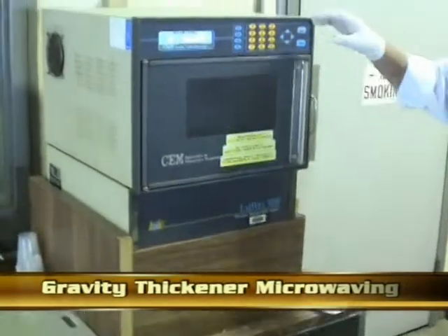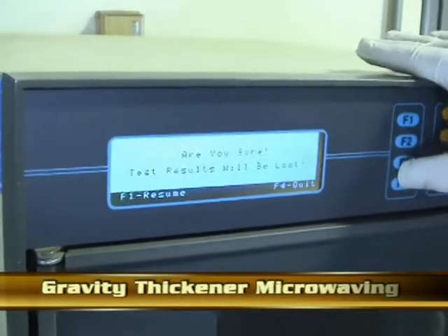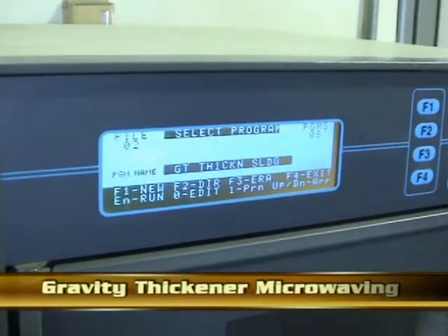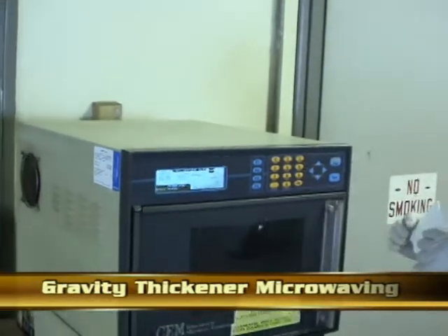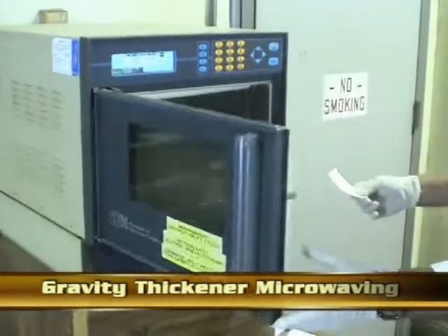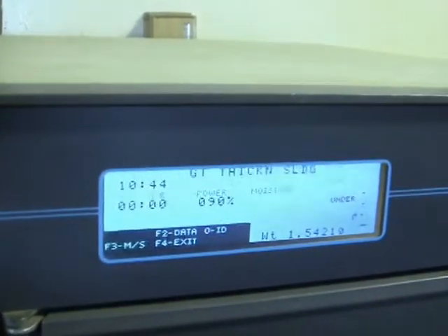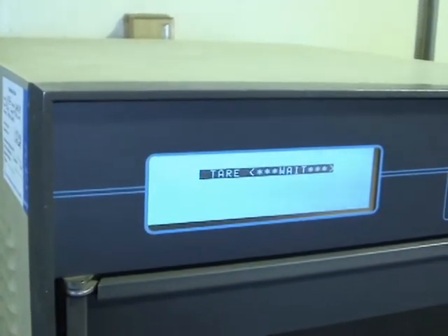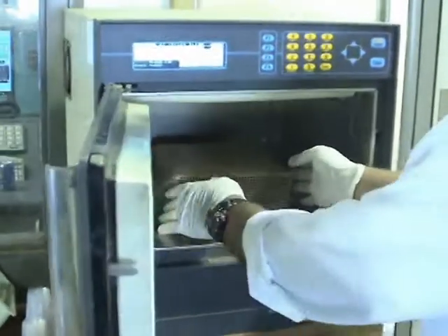Different types of samples can be analyzed for total solids. On this second analysis, the operator uses gravity thickener sludge. The operator scrolls through the menu and selects the gravity thickener option. As in the previous analysis, the operator tears the sample pads, adds a specific amount of sample, and starts the microwave program.